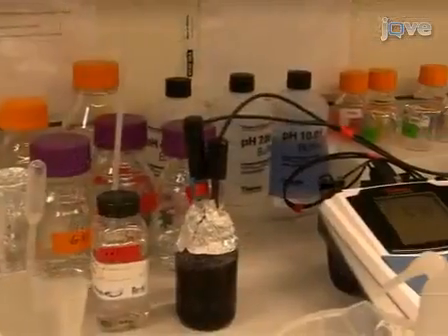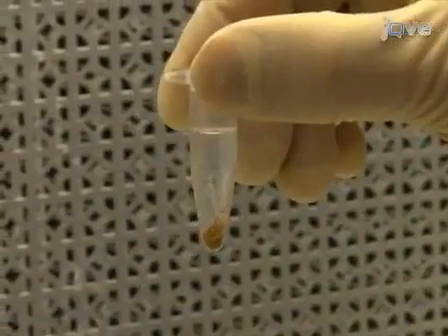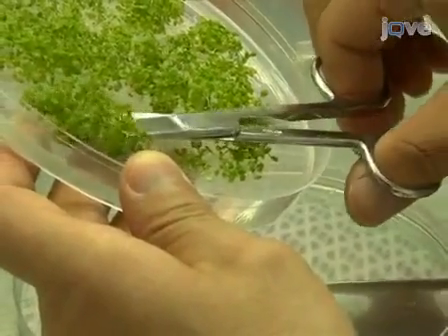Hi, I'm Zhiyang Jai from the laboratory of Olena Watamanuk in the department of Crop and Soil Sciences at Cornell University. Today we will show you a procedure for isolation of intact protoplasts from 14-day-old seedlings of Arabidopsis thaliana.